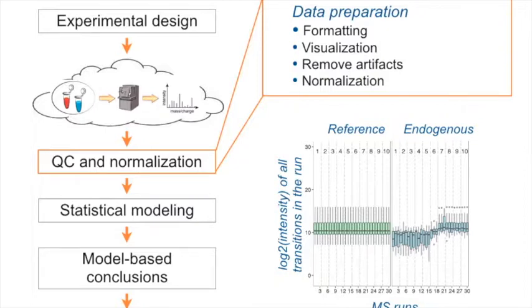On the other hand, you have a DIA experiment where you can pretty much quantify everything, right? Maybe many proteins change, but you can probably quantify a lot more other proteins. So then using the median normalization is a better way to go. And you can still have a single standard, for reasons we just discussed. Especially in DIA, when you have too many peaks, your standard can be compromised with overlap with other peaks, so the standard can be a bit tricky to use.